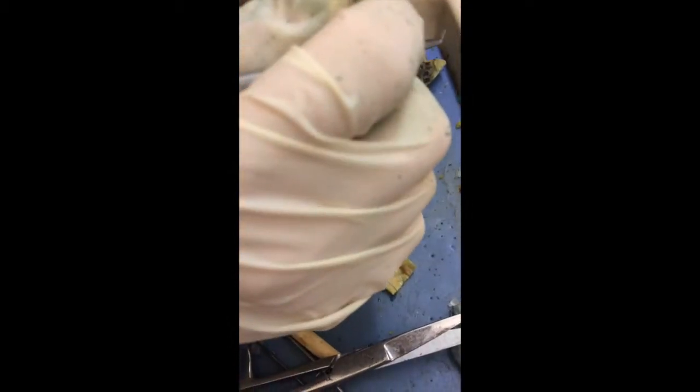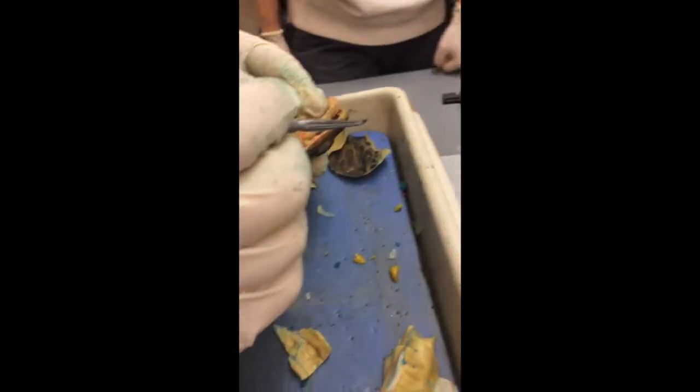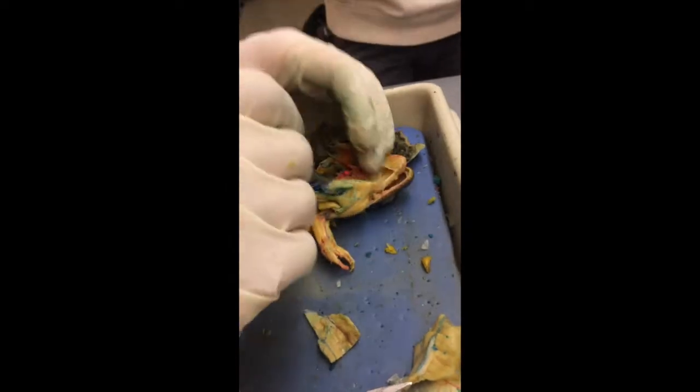Okay. Now, what else do we need to find for you guys? I want to find the pancreas and the spleen.